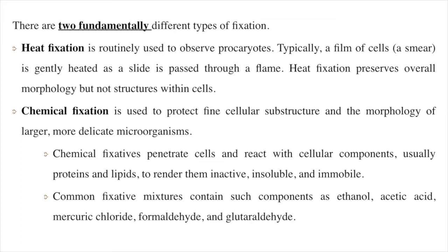So we have to prepare the microbial smear and then pass the microscopic slide through the flame to fix the microorganisms. The heat fixation preserves the overall cell morphology, but it cannot preserve the internal structures of the cells.